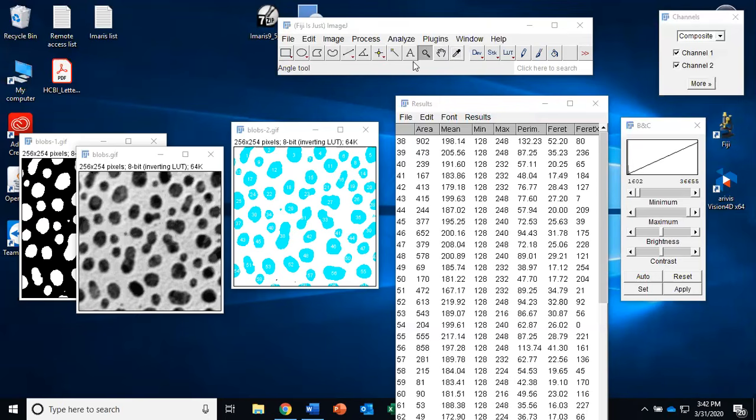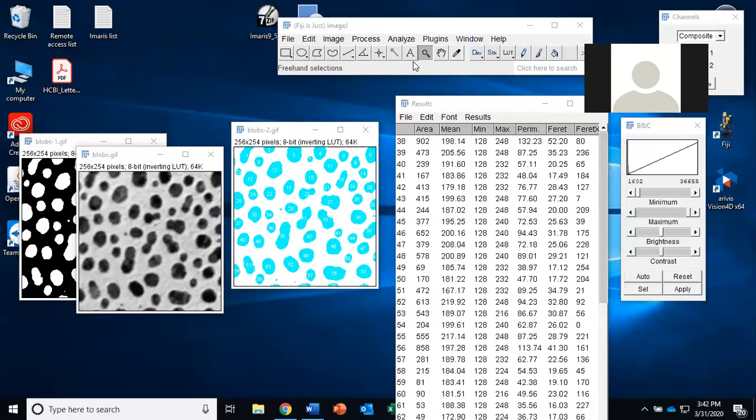Hi, I actually have a question. In order to do any co-localization analyses on 2D images, is it okay if we just subtract the background, convert it into 8 bits, and then threshold it, and then do a Coloc 2 analysis, etc.? Or do we have to go 3D in order to have the most concise overlap? It's a great question, but in general, what would be your best approach?